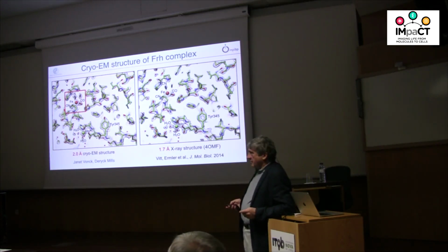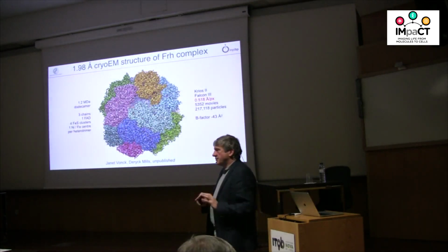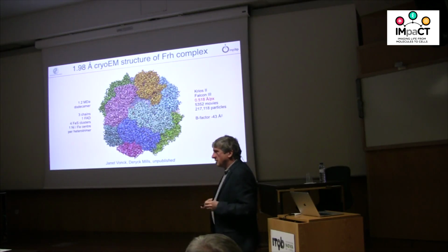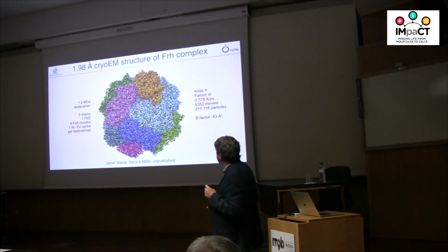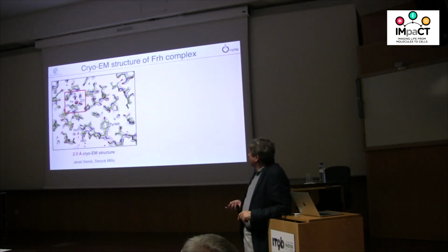Is the 2 angstrom resolution of cryo-EM general in all of the structure, or does it have parts where it's higher and lower? Well, in this case, since it's a spherical structure, it's very uniform. Of course, you always have slightly less good resolution on the outside, but it's quite a rigid little sphere, and that's why we use it. But there are other examples I'll show you later, where indeed you have low resolution and it's very different, with more flexible parts. But this is why it's a good test specimen. It's a fairly rigid ball basically, so it's pretty much of this quality right through. Yeah, right. So there we go.